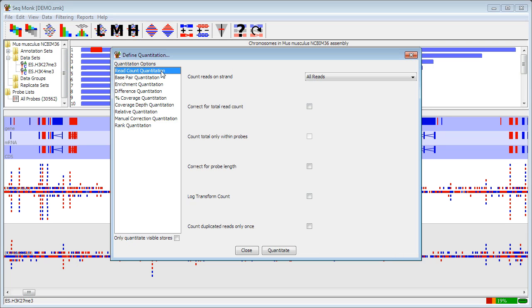The one we're going to look at to start with is the read count quantitation because it's fairly straightforward. I'm going to make a couple of changes in here. So rather than just counting reads I'm going to log transform the count so I don't get too wide a dynamic range on here. I'm going to not count duplicated reads so if the same read turns up more than once I only count it once.